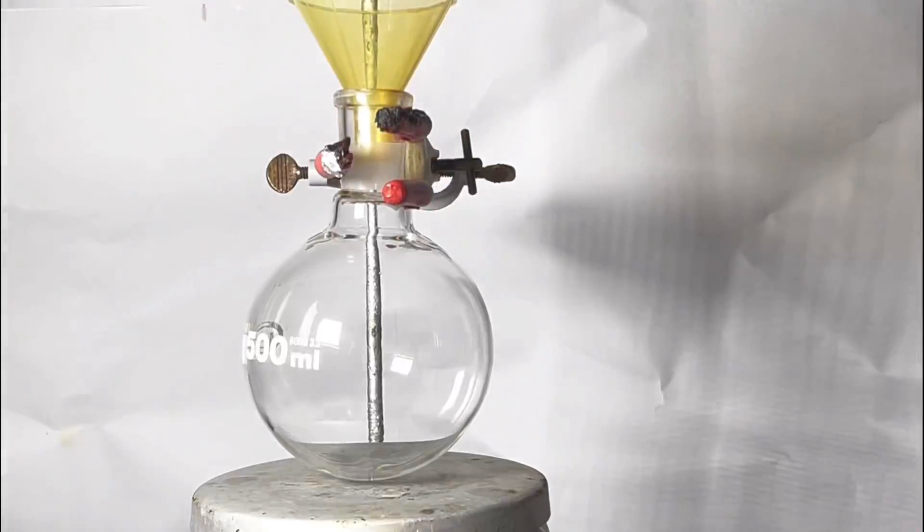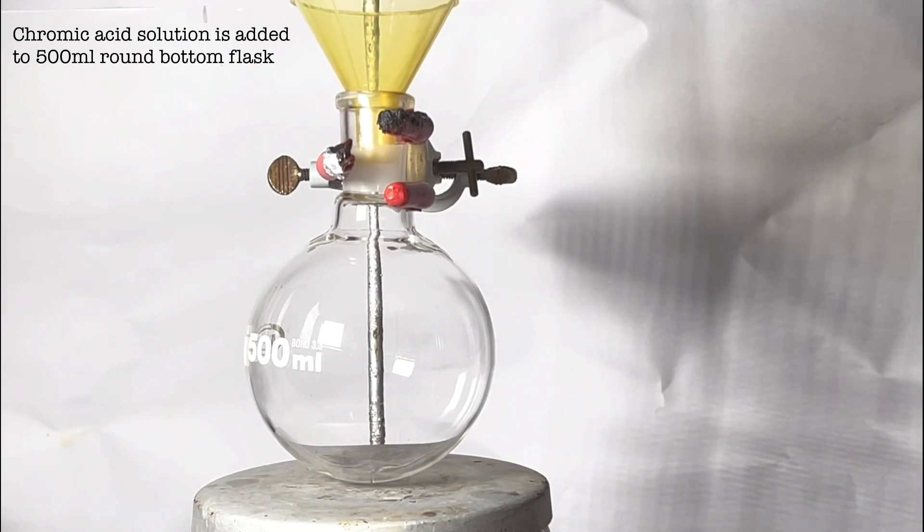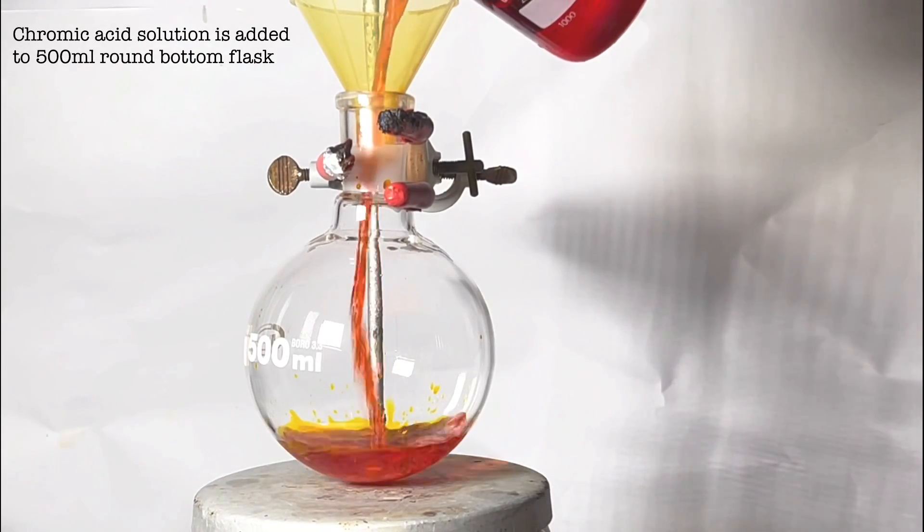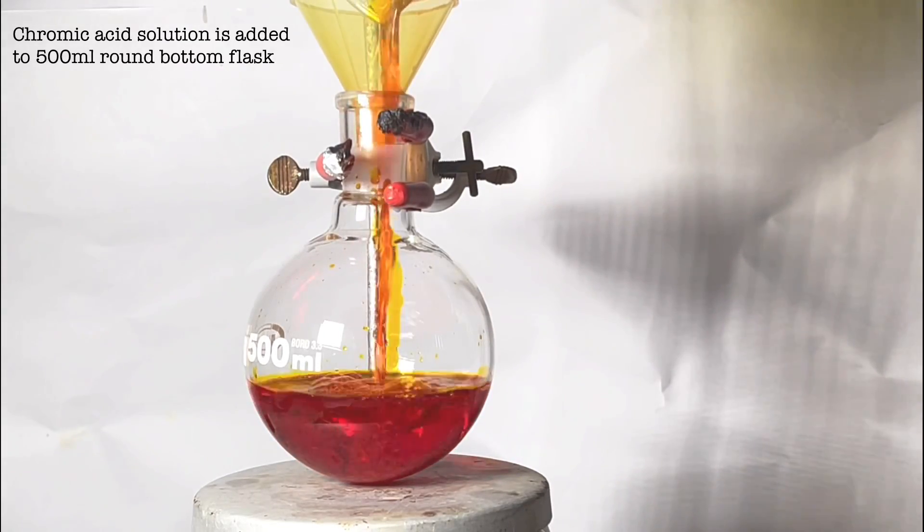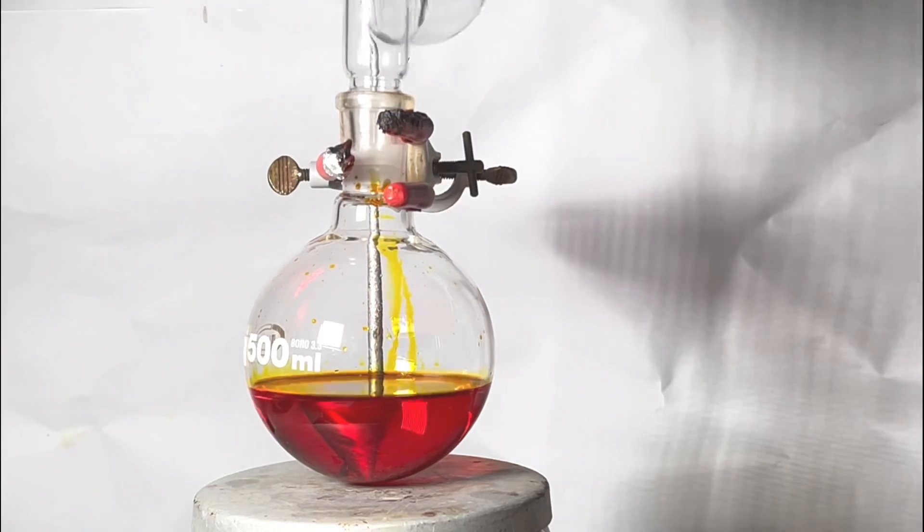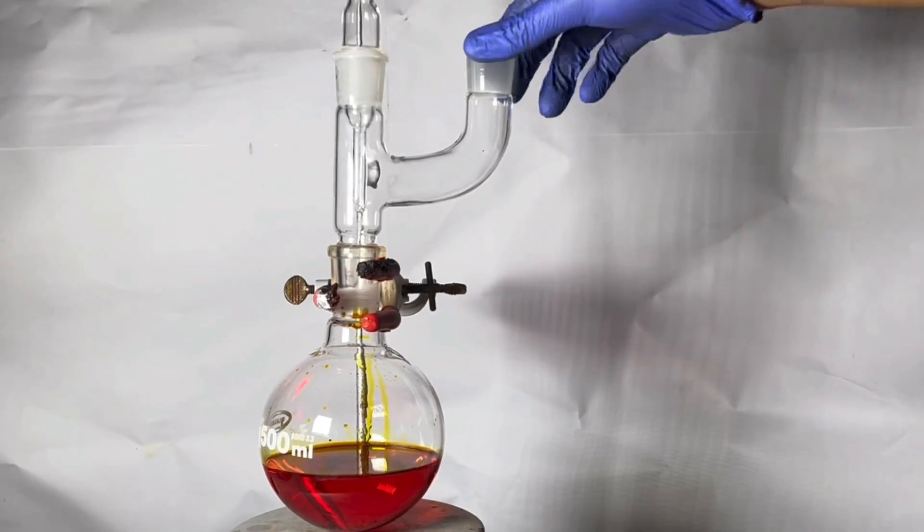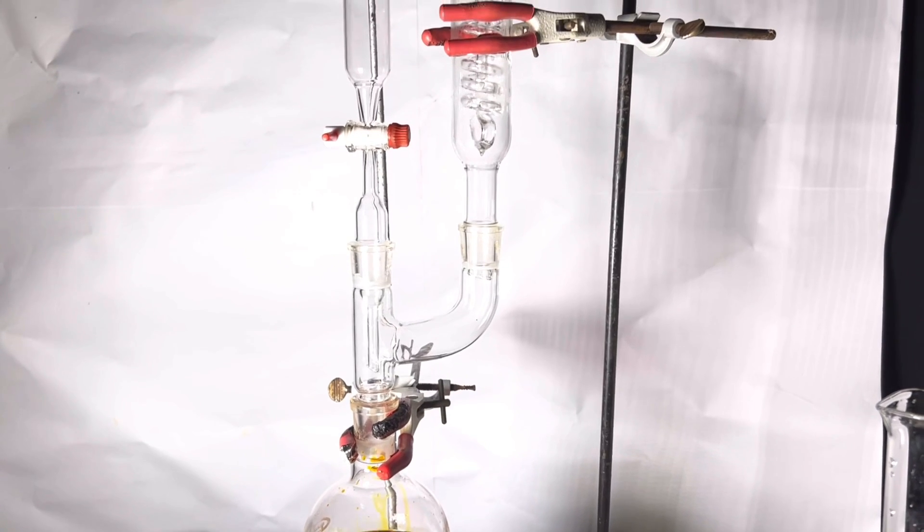Next, a 500 milliliter round bottom flask was fixed on a stand over a hot plate stirrer. The previously made chromic acid solution was added to the round bottom flask using a funnel to prevent spilling. The flask was equipped with a two neck claisen adapter. One of the necks were equipped with an addition funnel and on the other neck a dimroth condenser was attached.